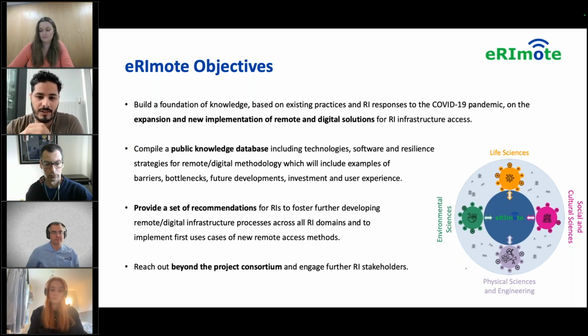As you can see on the screen, one of the objectives of the eRImote project is to create a public knowledge database, including different aspects related to remote access provision, which we did in the project. It's called the Online Information Platform.